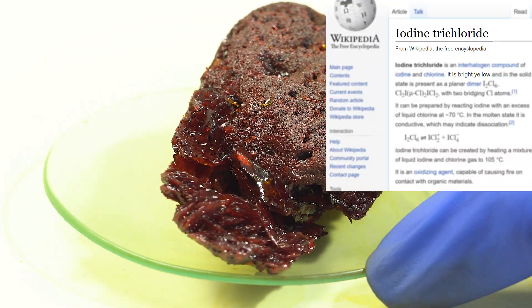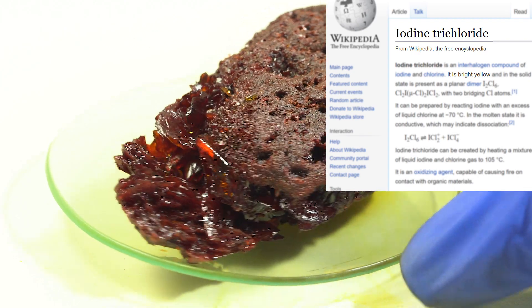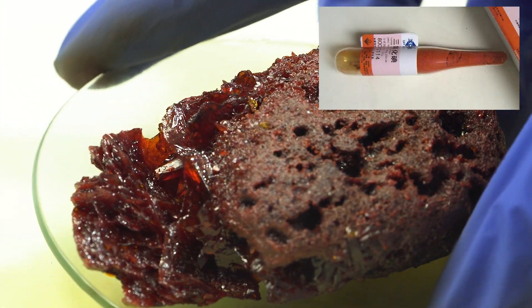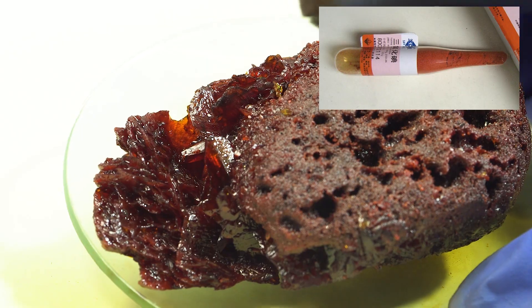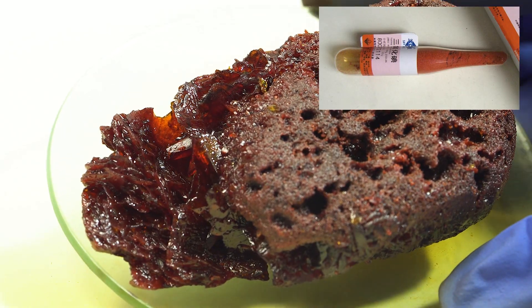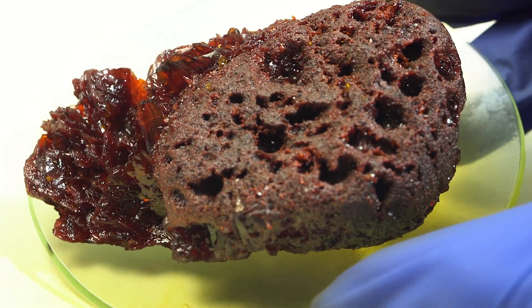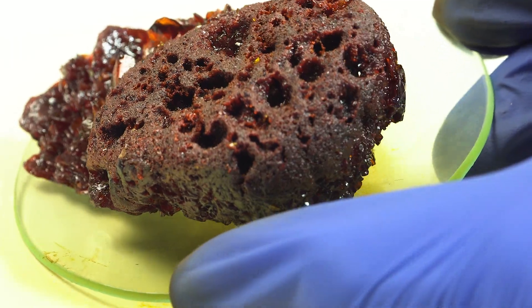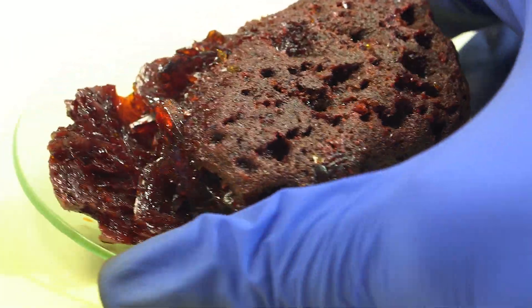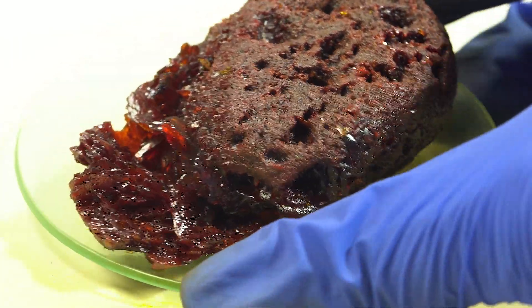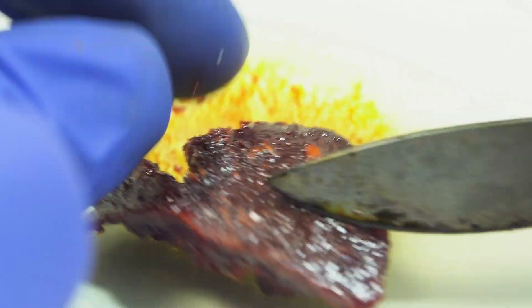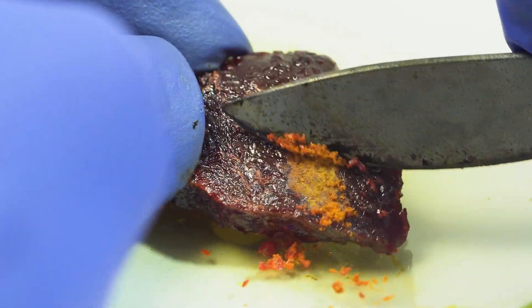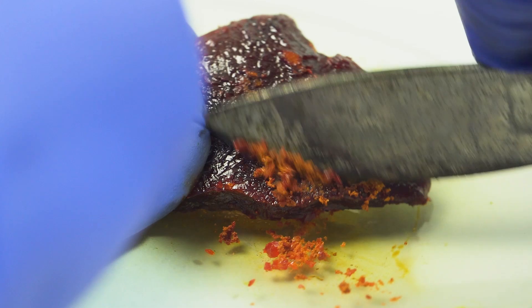Wikipedia says that it's a bright yellow powder, but it's not yellow at all in the ampoule next to its picture, yet it's of the same color as mine. The thing is that during prolonged storage or keeping in the light, iodine trichloride gets covered with elemental iodine, that adds such a burgundy color to it, so if we scrape off this thin layer, we will see the yellow color of iodine trichloride that we need.